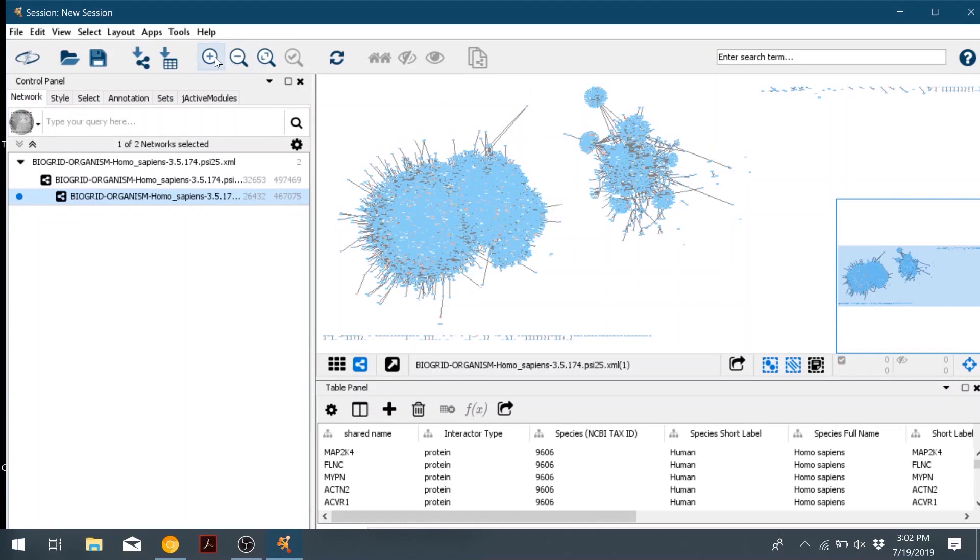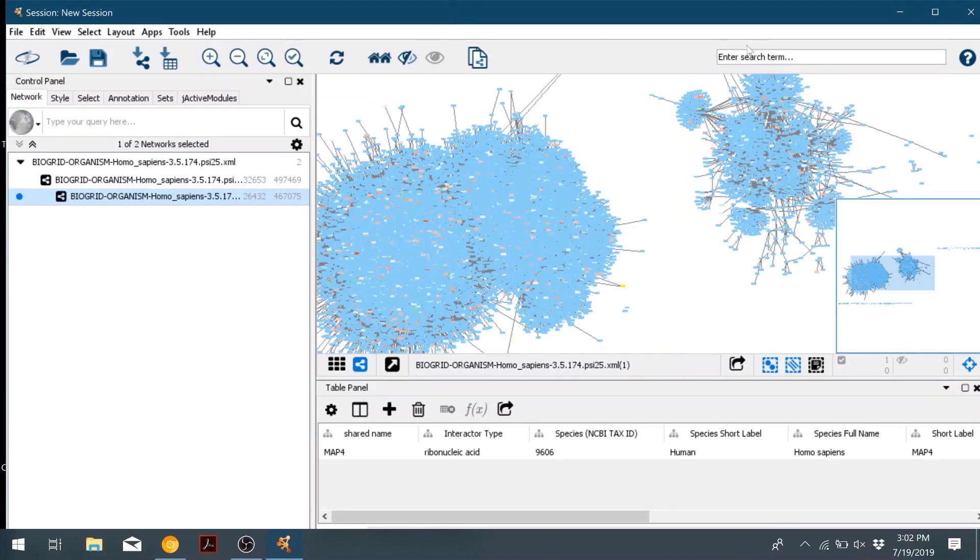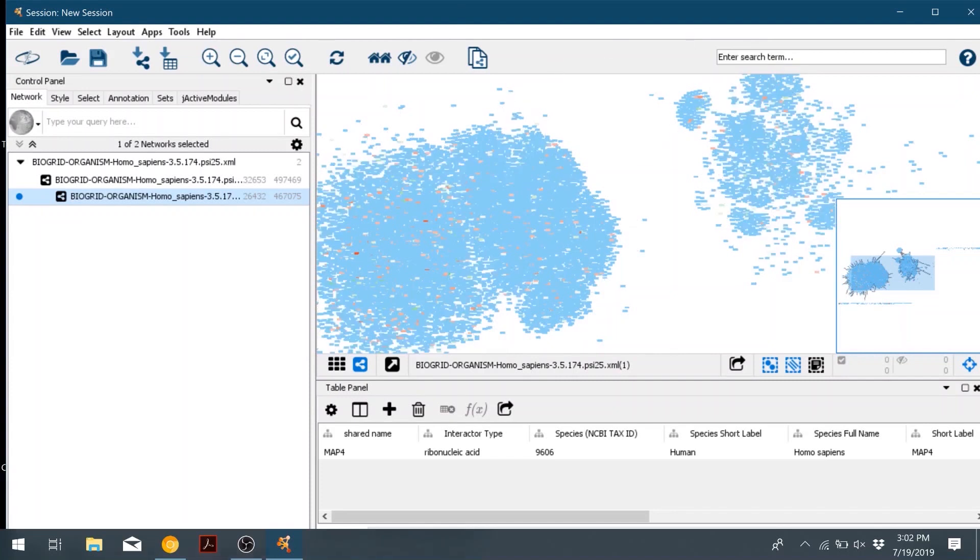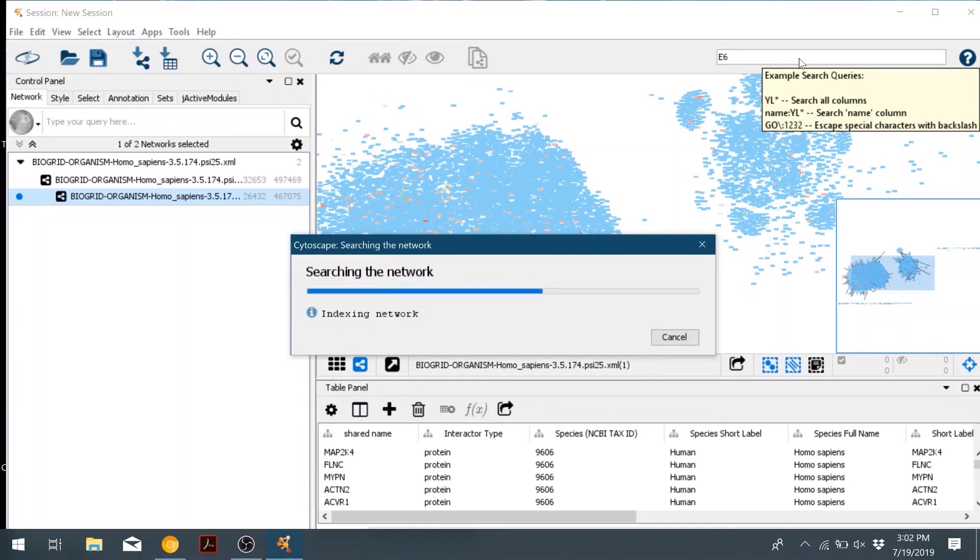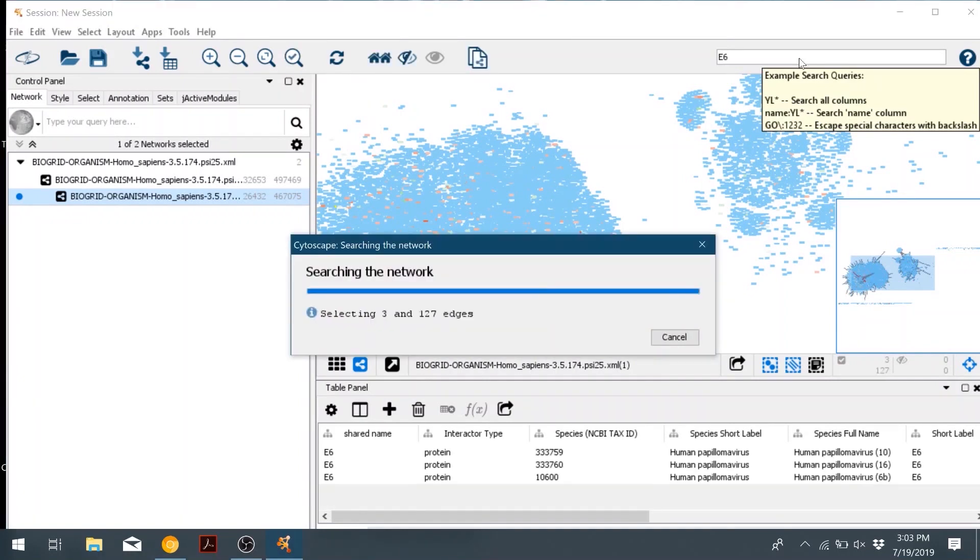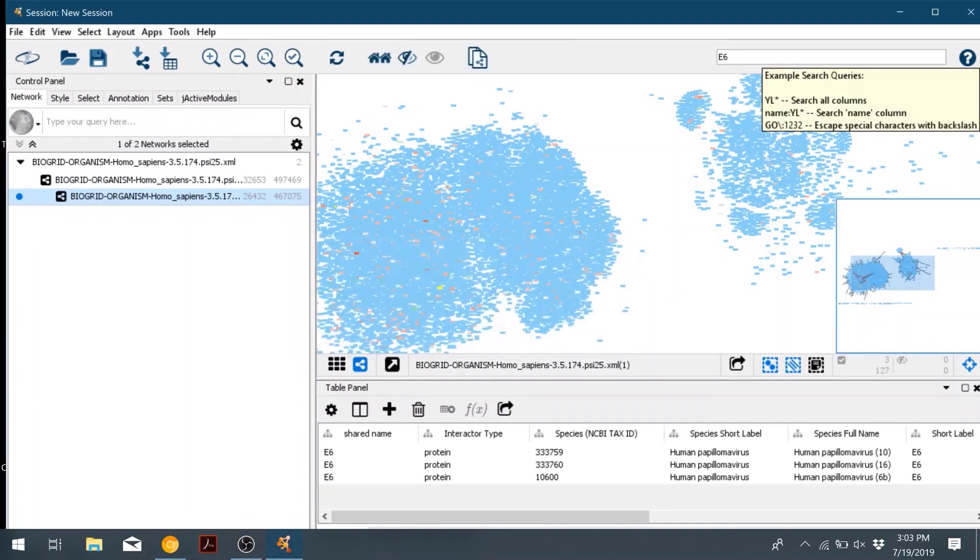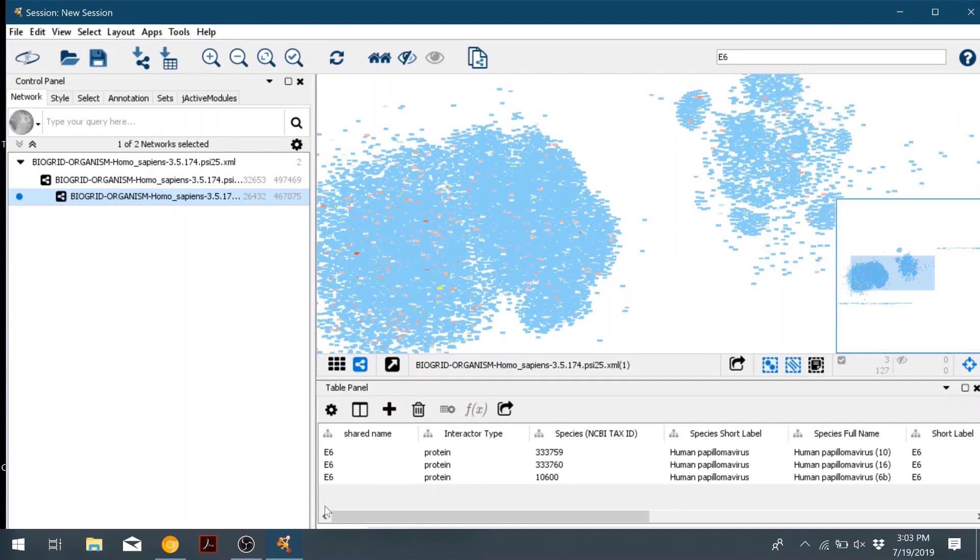So now we're going to create a sub-network that shows all of the proteins that interact with E6. In the search bar in the top right corner, we're going to type in E6. And then three different E6s come up for the different HPV viruses. We're going to select the HPV16.